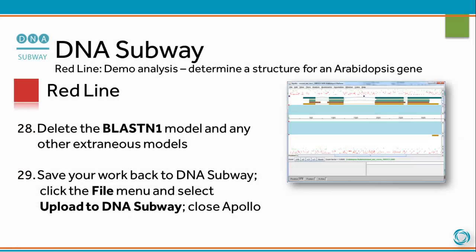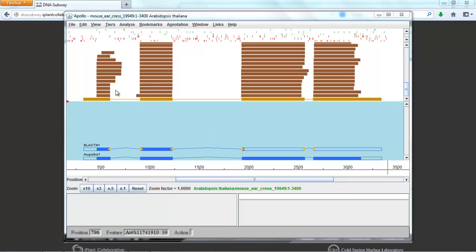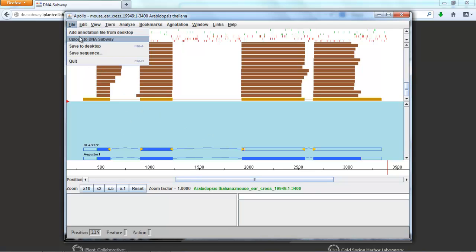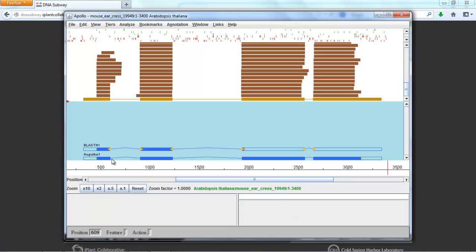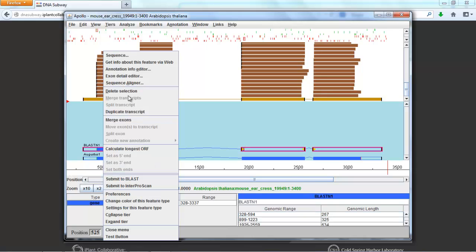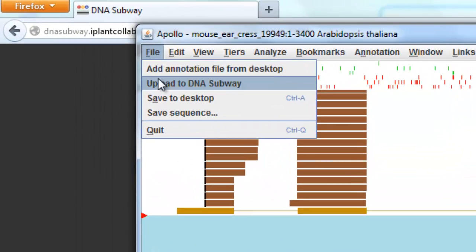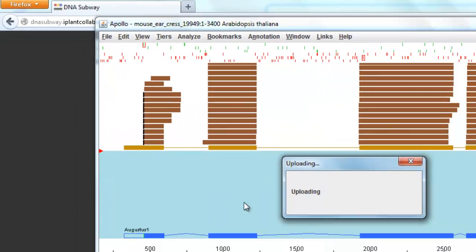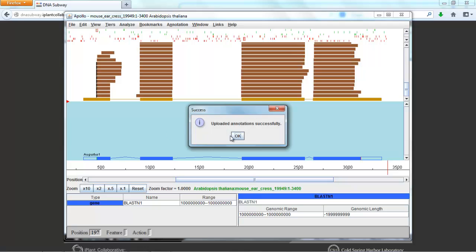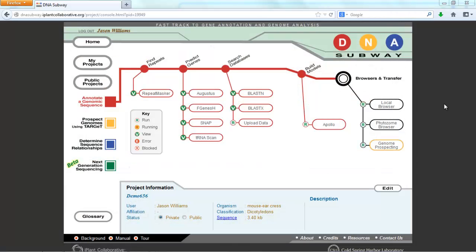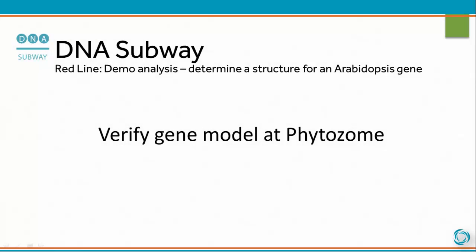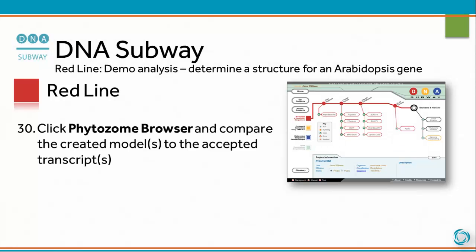Delete the BLASTN1 model and any other extraneous models. Save your work back to DNA Subway: click the File menu and select Upload to DNA Subway. Close Apollo. Click Phytozome Browser and compare the created model to the accepted transcripts.